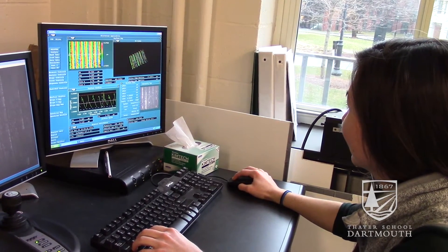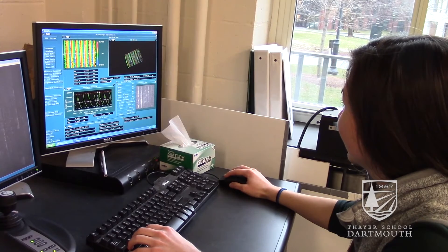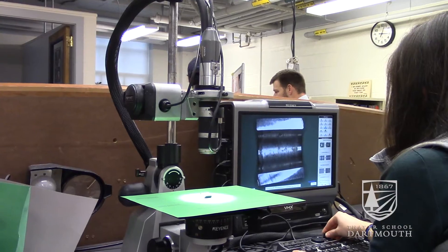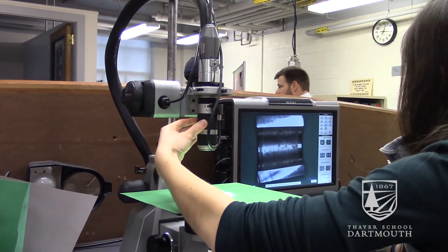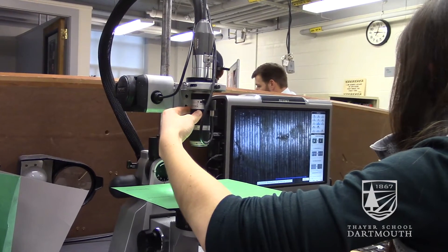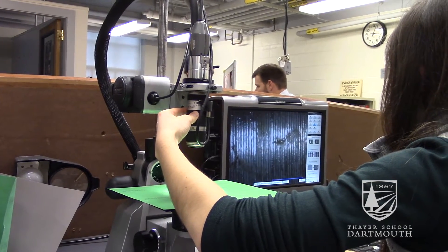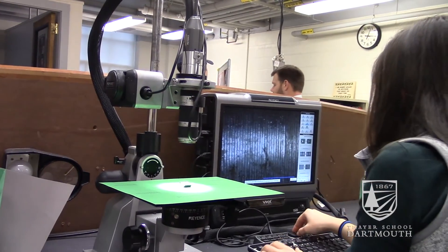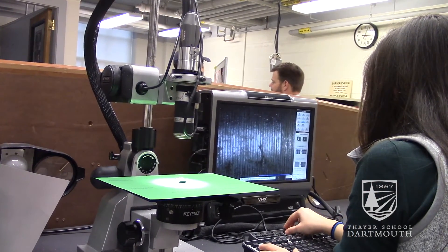In order to evaluate these implants, we use any number of microanalysis techniques and metrology techniques, some of which include optical microscopy and scanning electron microscopy. We can zoom in to an area of an implant and look at something in more detail and see what the character of that surface looks like.